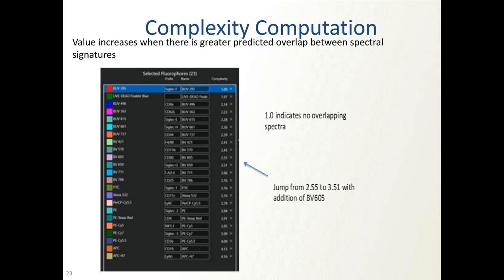Okay, so once we have all this plugged in the system, the next step is we run all the controls. And as we run these controls, it's just a simple matter of running, in this case, beads and then cells for the live dead. It basically says, this is a good control, there's enough positive, boom, and we'll do that. And it goes through and adds it into its little calculation and tells you a green check mark, or a yellow warning, or a red, no, that's not working.